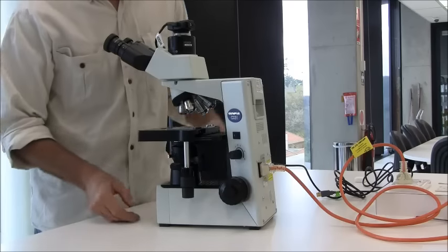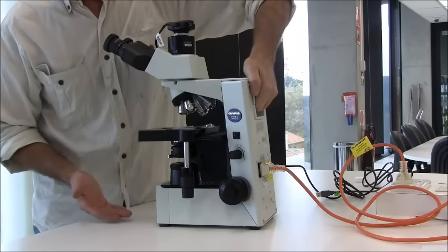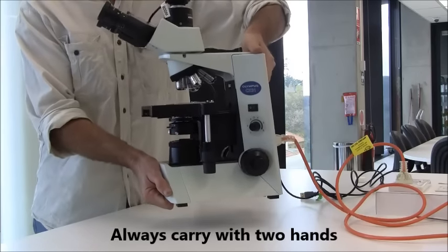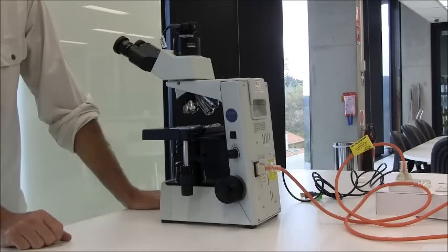Well, I'd like to direct your attention to the handles for moving this microscope. They are quite heavy. There's a very convenient handle up on the post and one under the front. And so when moving these, it's a two-hand grip. Gently set it onto the bench.